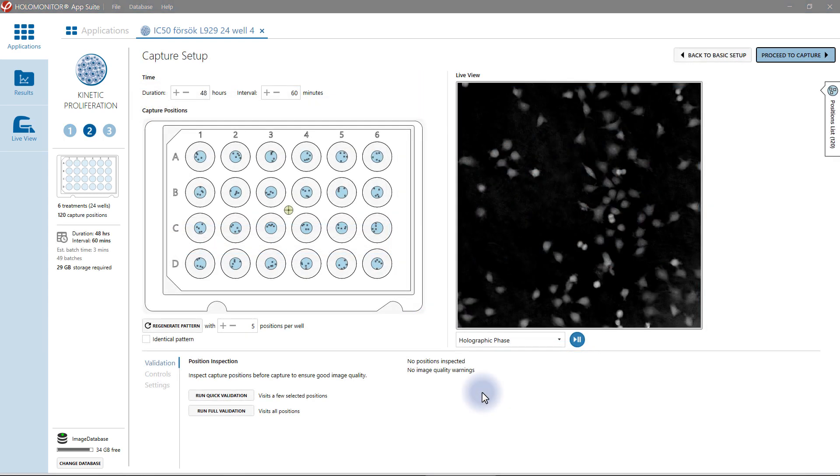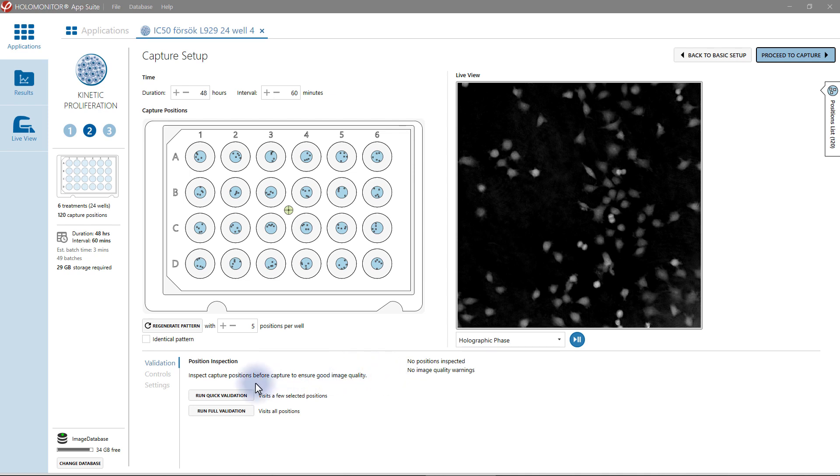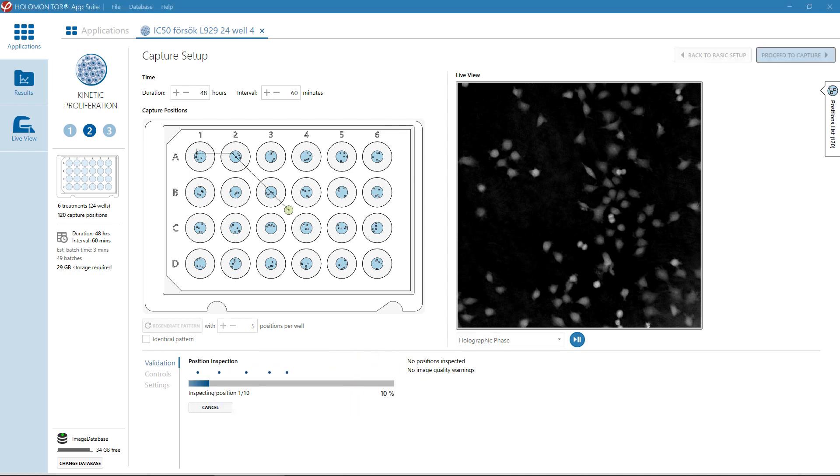Next is Capture Setup. Here you decide how often you want the instrument to capture images of your cells and for how long. The instrument will choose positions for imaging. A quick validation of the image quality in selected positions is recommended to ensure optimal image quality.